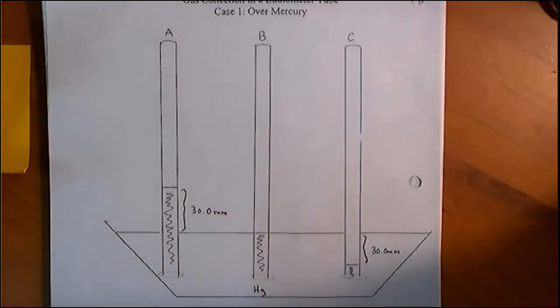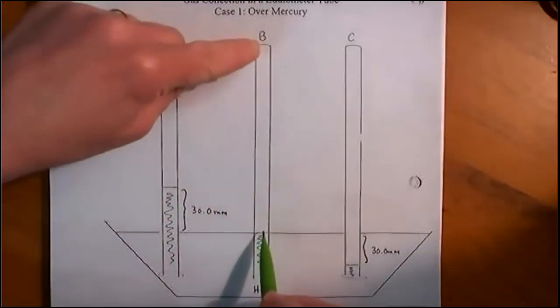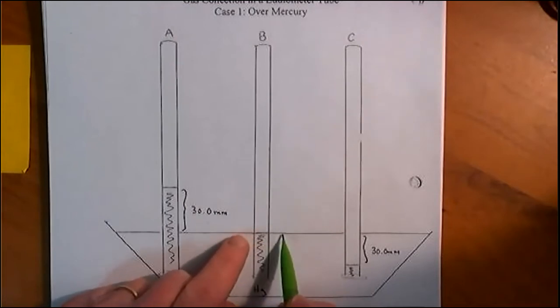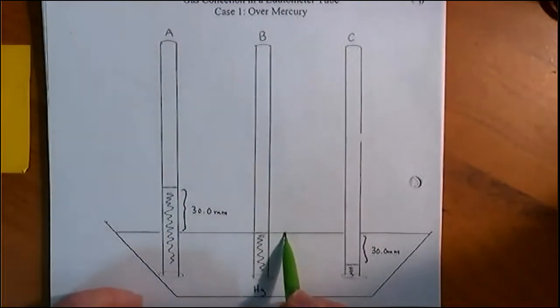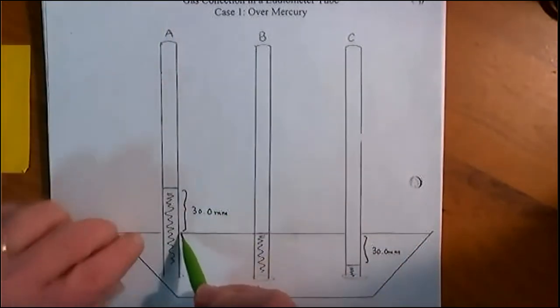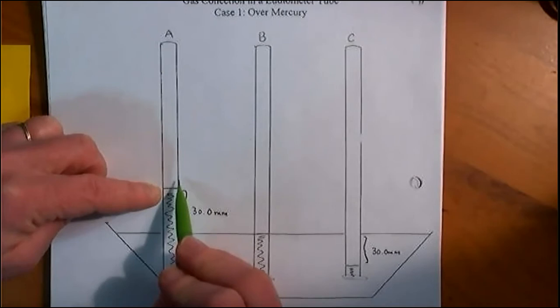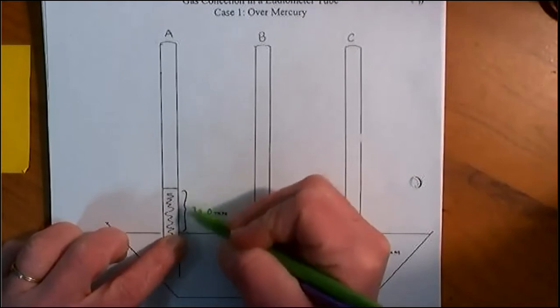And what we're encountering is this middle eudiometer has gas collected just until the liquid level inside is equal to the liquid level on the outside. I know you can imagine that based upon the lab work that we've done. To the left, in this direction A, can we imagine that we've collected gas, but it's stopped here, and so the liquid level inside is higher than outside, and we could actually take a ruler and measure that height.